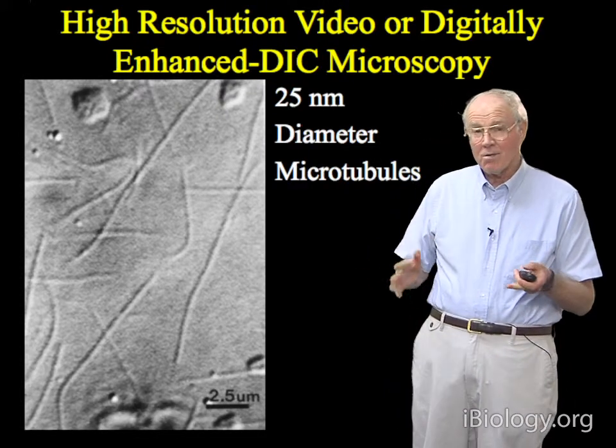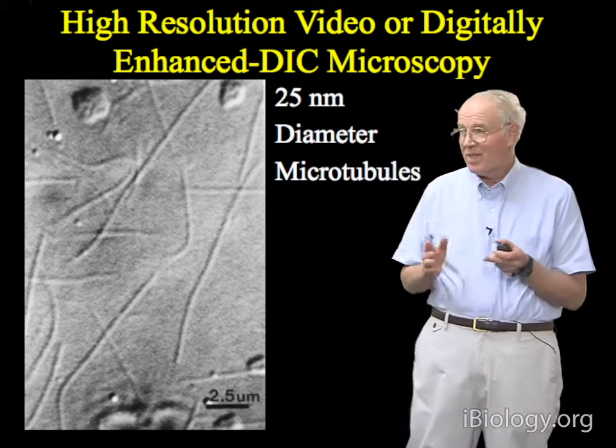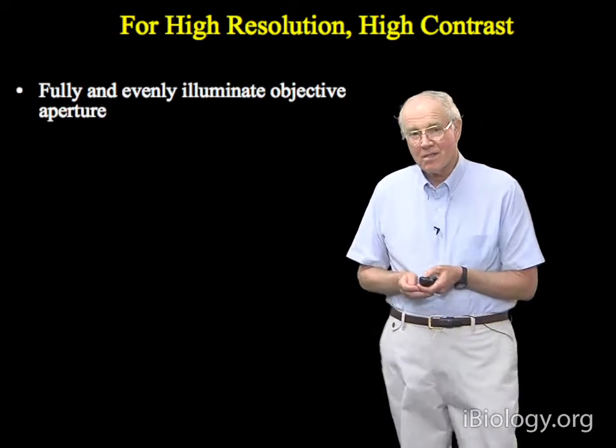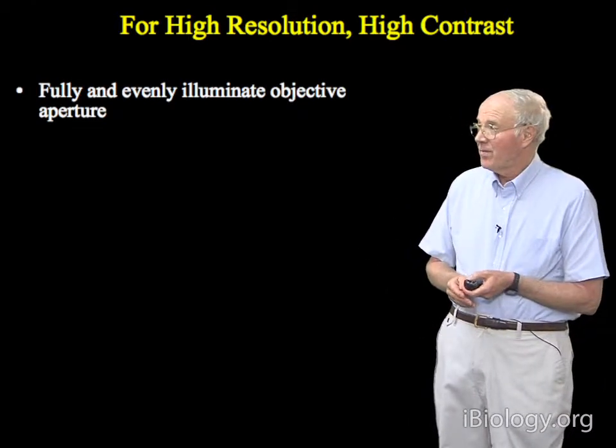But with the awesome power of electronic contrast enhancement, you can bring up this scattered light and make these objects visible.